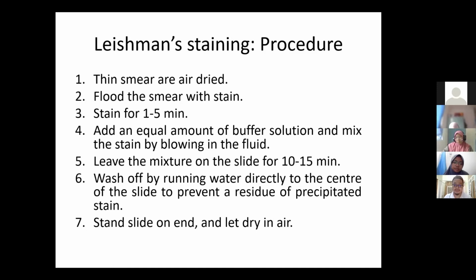On the slide, we wash gently on the area to prevent residue of any precipitated stain, but only briefly. You can also do the overflowing method. Then stand the slide on end and let it dry in air. Again, gently. You can use tissue paper to blot the edges, but do not rub on it. Do not put it on a heater. Do not blow with a strong fan, etc.